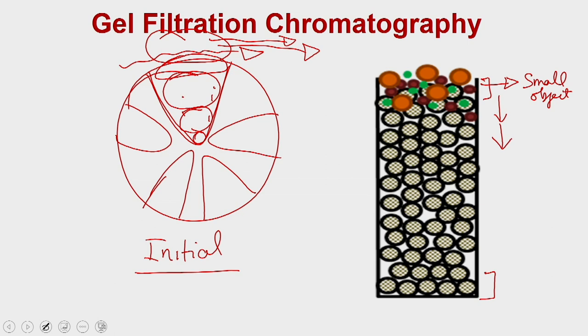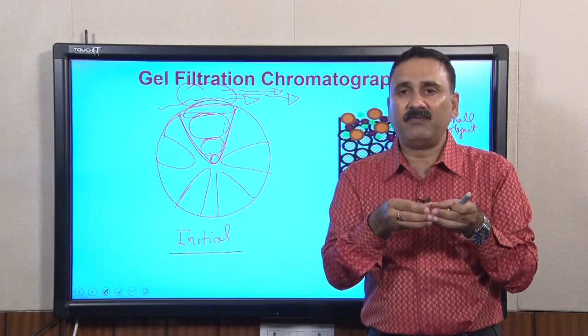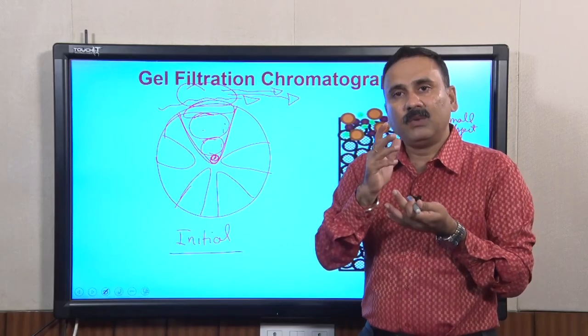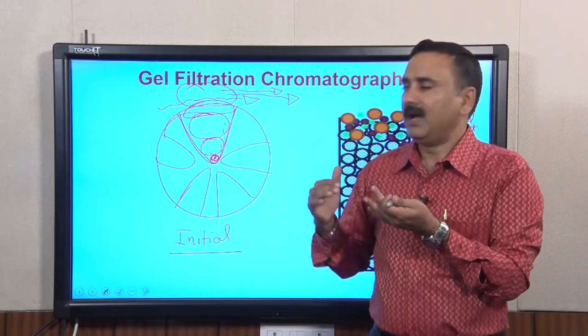So, if you have a confusion that every bead is going to have all of these molecules arranged in its pores, then that is not true, because the dynamics of these molecules are very different. Because of their sizes, the dynamics of the small molecule is going to be very large. That is why when the molecules are distributed from the buffer which is filled within the pore versus the aqueous environment outside, in the first layer, when that distribution occurs, the objects are going to be filled at the bottom of the pore, and by the time the next molecule tries to fill into the same pore where the already existing molecules are present, it will get overflowed by the liquid, and then it will get exchanged into the next layer, and in the next layer it is going to sit like this, and then in the third layer it is going to have this.